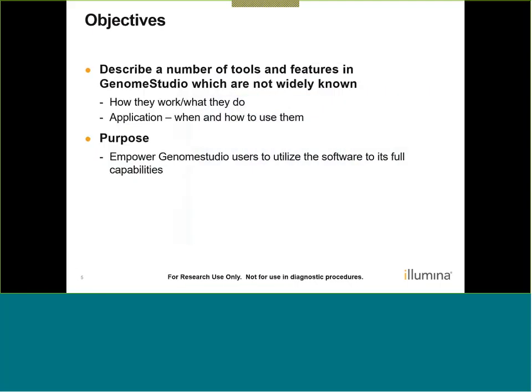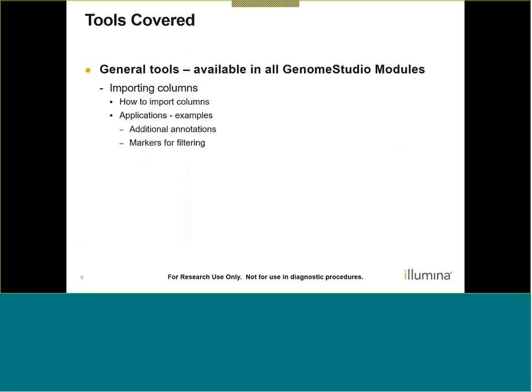Today our objectives are to describe a number of tools and features in GenomeStudio which are not widely known, how they work and what they do, and how you may want to use them. Our purpose is to empower users to use the software to its full capabilities. So let's go over some of the tools we will be reviewing.